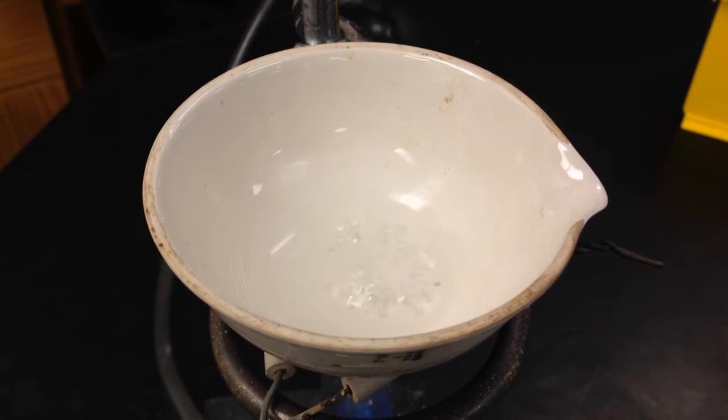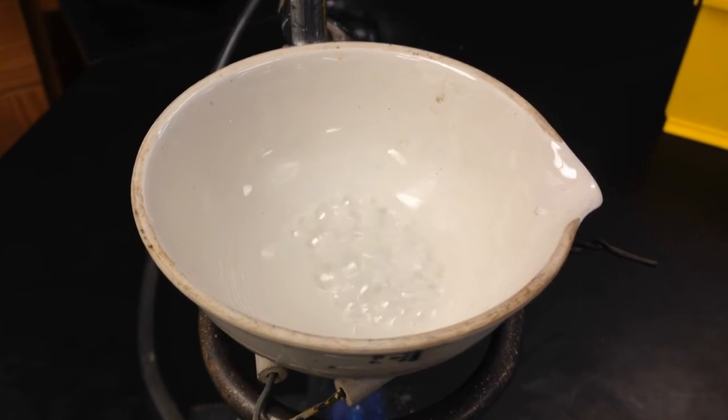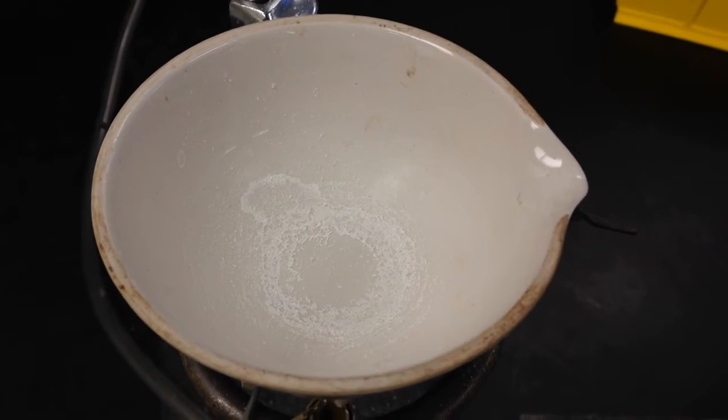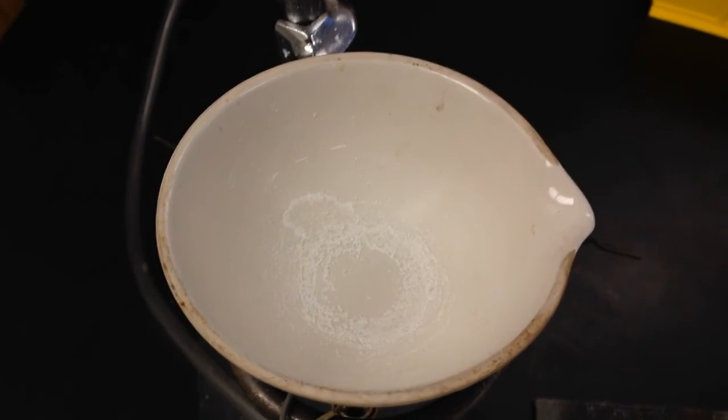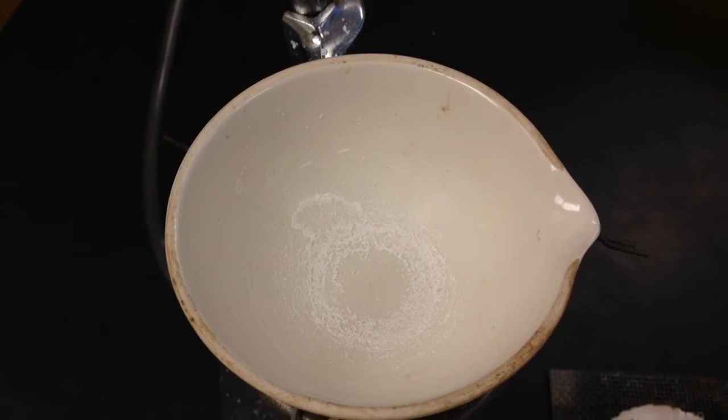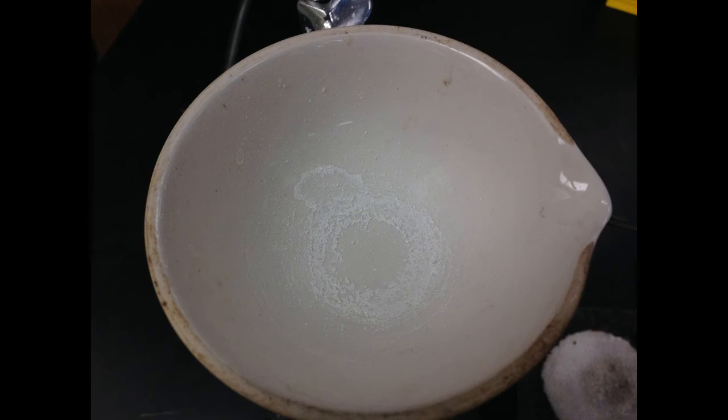And finally, we have the Bunsen burner heating the filtrate inside of the evaporation dish. And when all of the filtrate has been evaporated, the evaporating dish will look like so. Record any observations and then draw a particle picture of the contents of the evaporating dish.